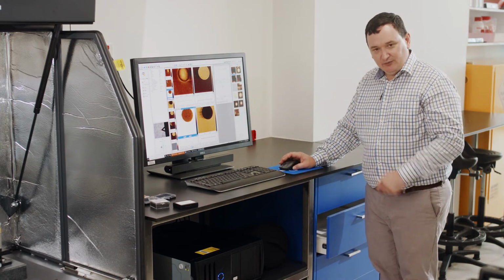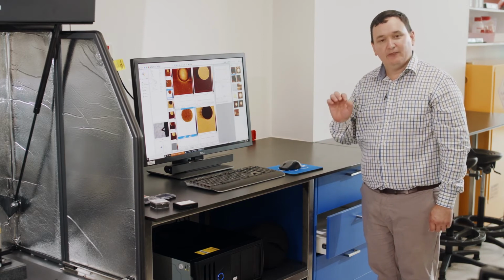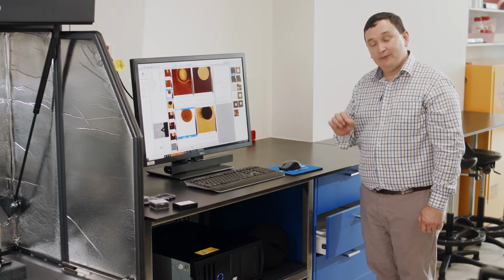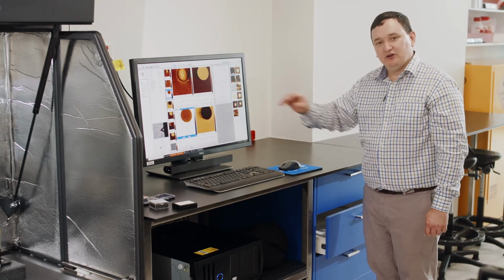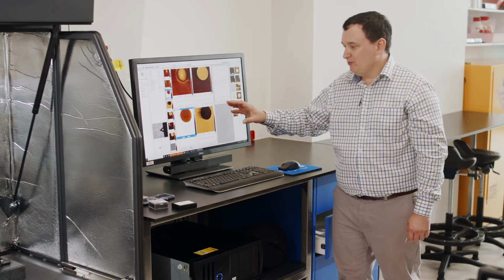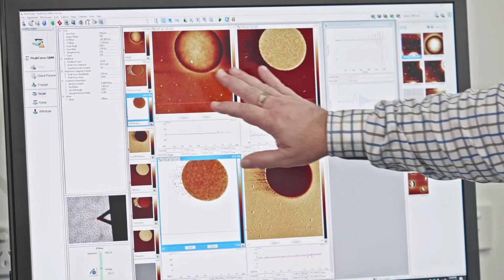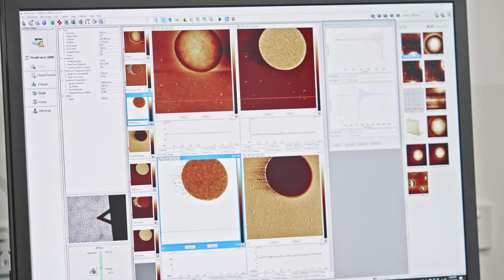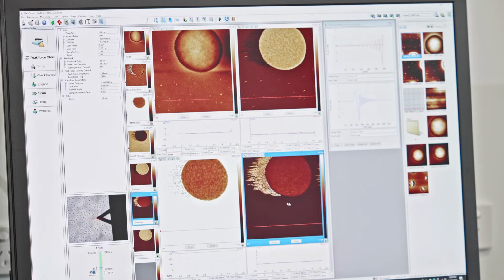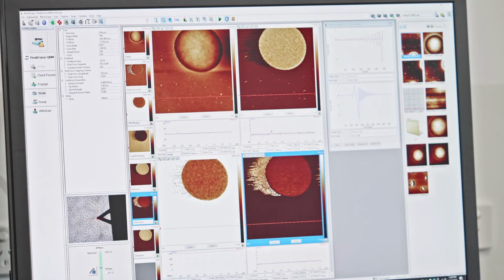Now there is one further calibration which we won't go into within this training session, which is calibrating the shape and the radius of the apex of the probe. And we'll cover that in a different training session. So for now what you have is a probe which is calibrated for the cantilever stiffness, which can separate out topography and mechanical properties such as adhesion and modulus, and, let's say here, deformation, or how compressible the material is. So you have this data that's available to you, and it can be rendered really down to the nanoscale.